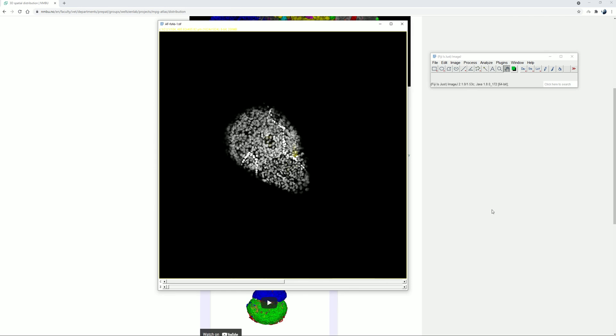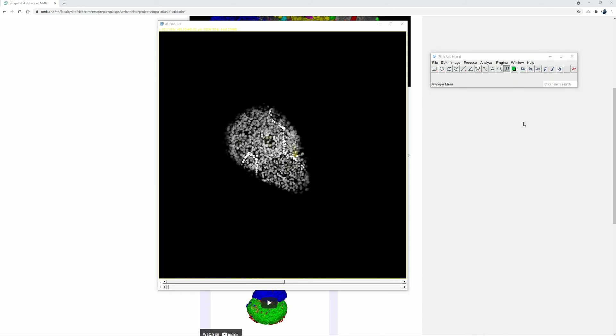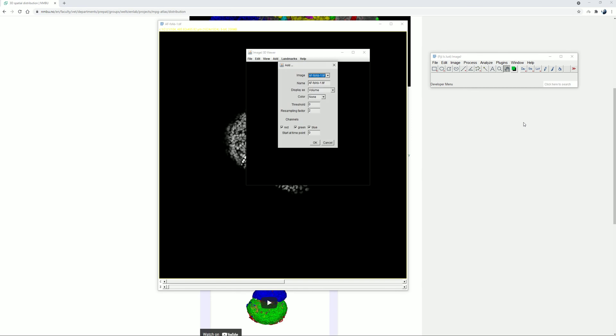So now, we go to the Plugins menu and select 3D Viewer. A new dialog window will pop up. Leave everything as default except for the resampling factor where we change the value to 1, and then click OK.